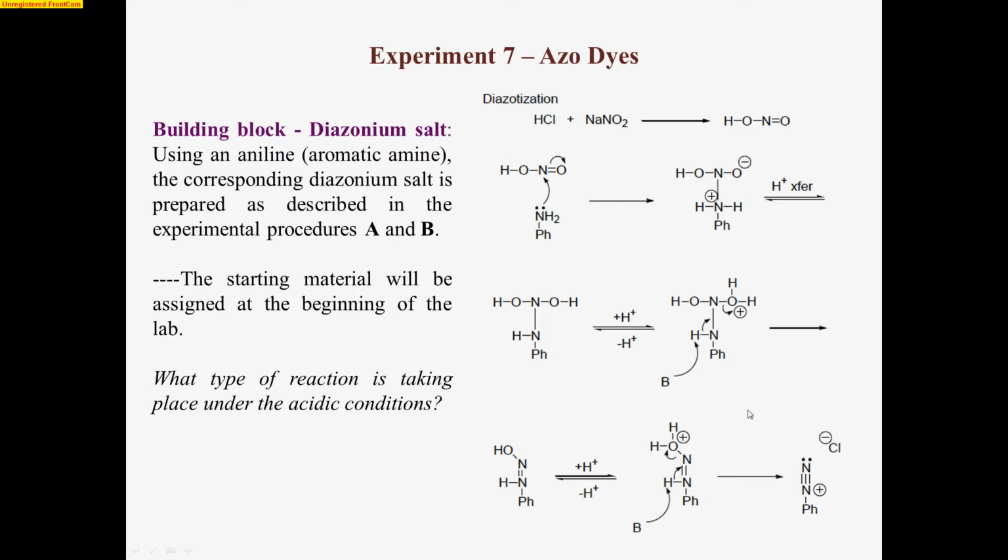And thinking about it, what we eventually want to get to is to convert aromatic anilines into these diazotized aromatic molecules.